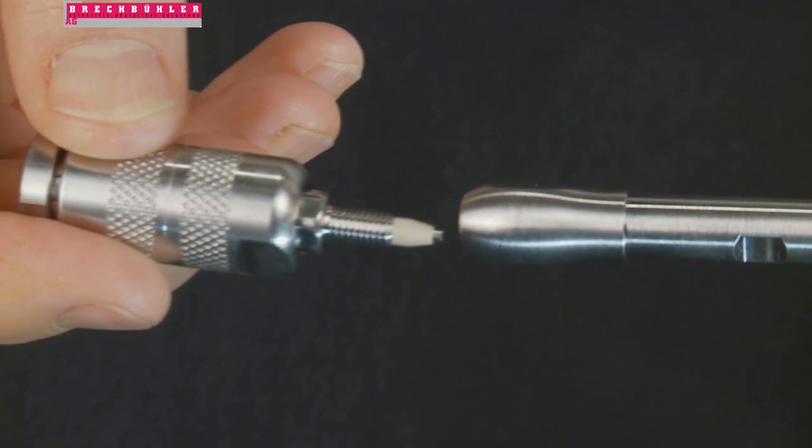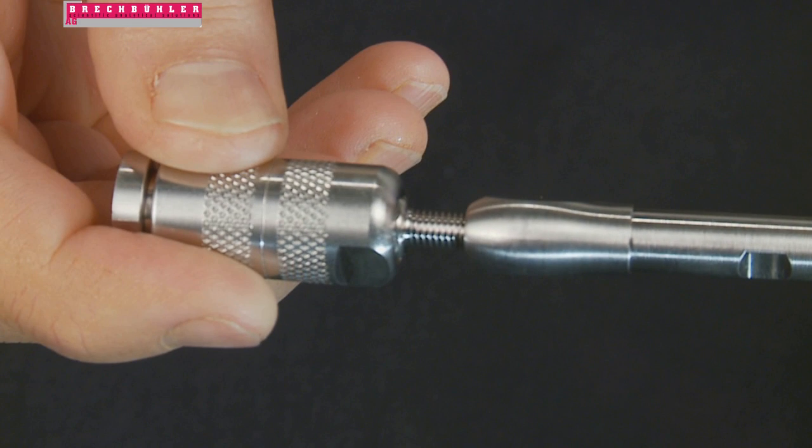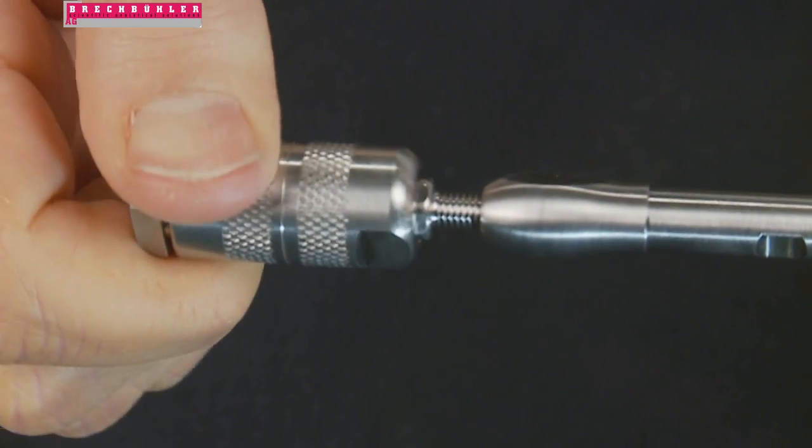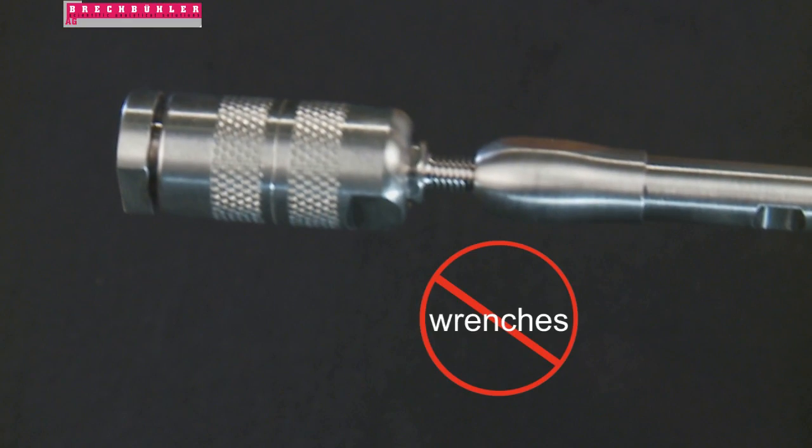Now that your Security Guard assembly is complete, let's attach it to the HPLC column. Firmly push the nib end of the cartridge holder straight onto the column end fitting. In a clockwise direction, hand-tighten the complete holder assembly onto the column. Do not use wrenches when connecting the Security Guard assembly to the column, as it may cause assembly or column damage.